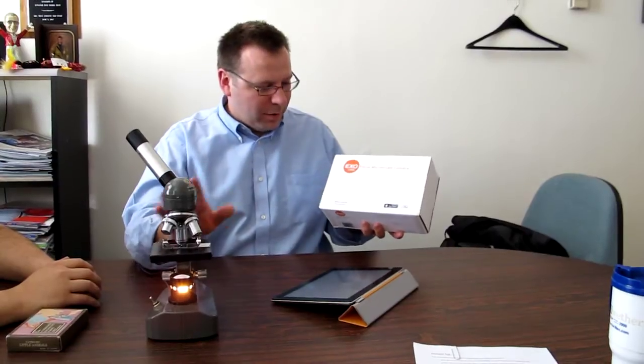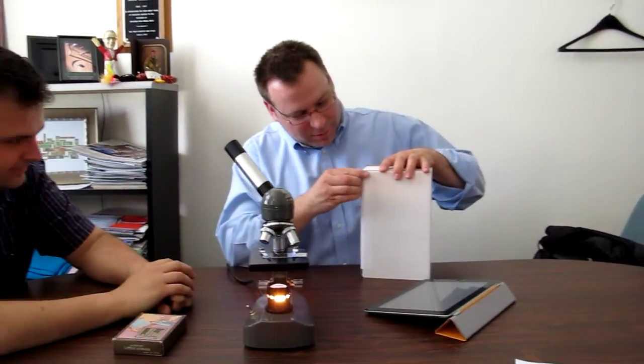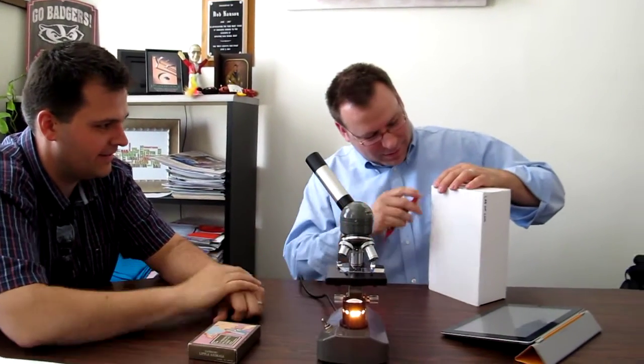All right, here is our Focus microscope camera. Got the microscope ready. We haven't bought... we've been dying to open it yet. So here we go, give me something sharp. Use this pen, red pen, the red grading pen.